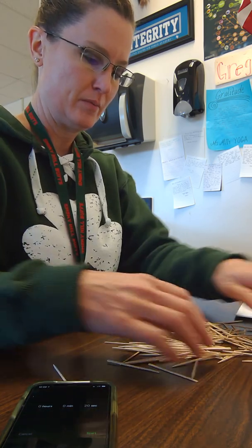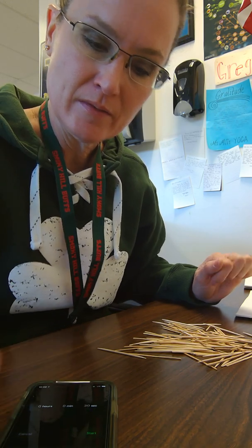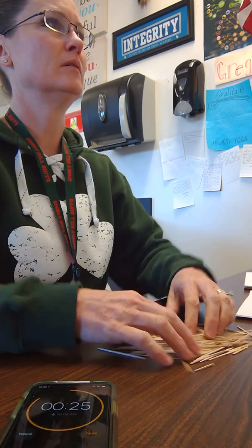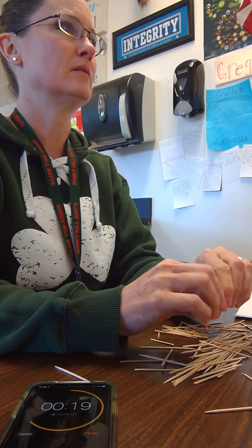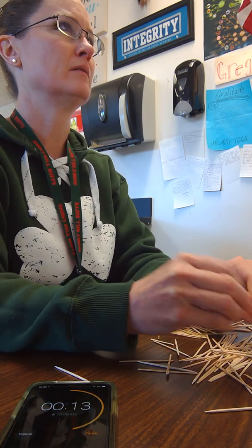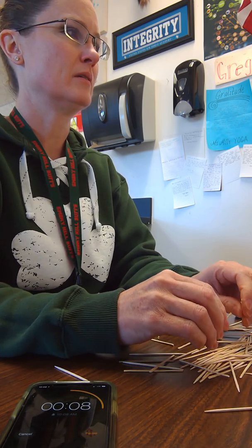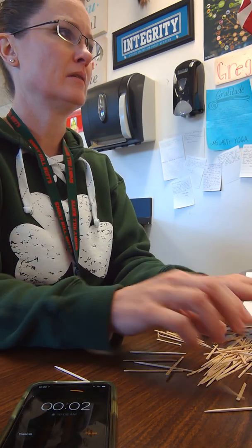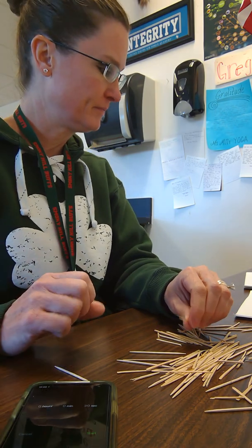And so we will mix them all up. And then we need to change this to 30 seconds. And start. So 1, 2, 3, 4, 5, 6, 7, 8, 9, 10, 11, 12.